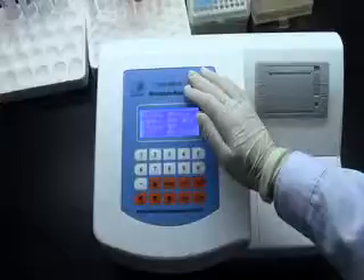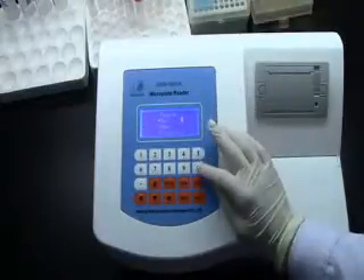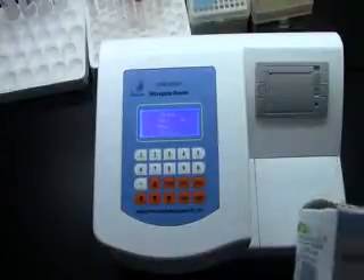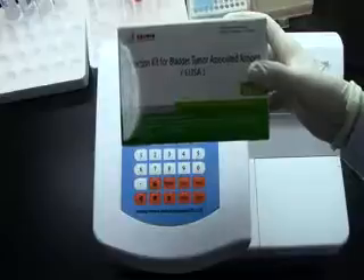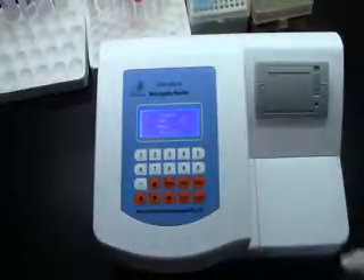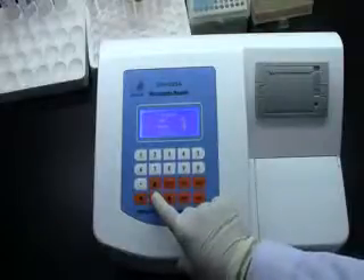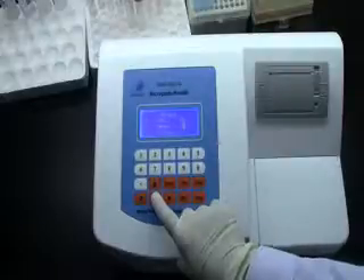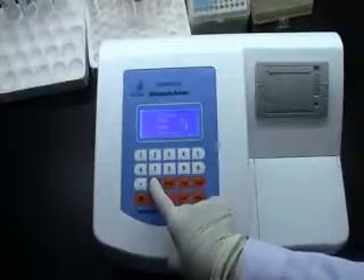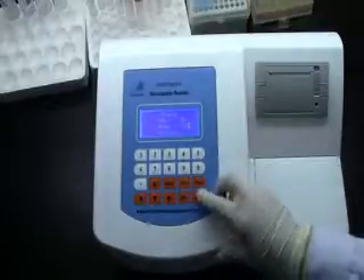Before we press the detect function, we should program first. So let's press 2 at the beginning. Program number — we can input, for example, 01. Press ENT to confirm. For the name, this microplate reader is always used to test the bladder tumor-associated antigen using the ELISA method, for example. So we input the name BTAA. Press ENT to confirm.